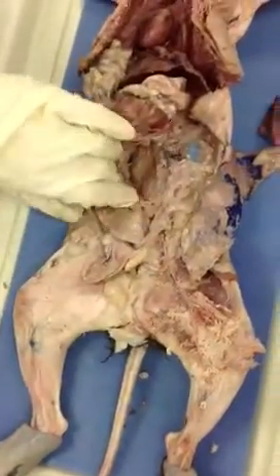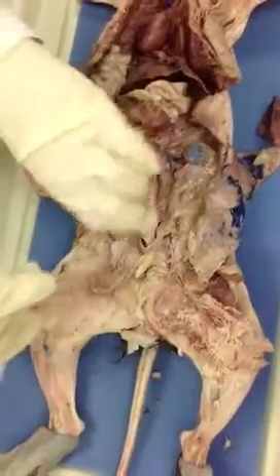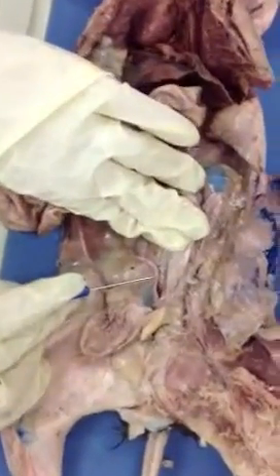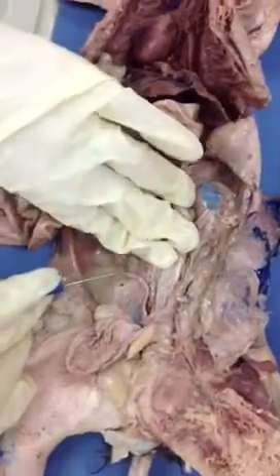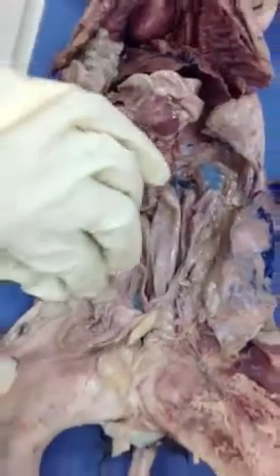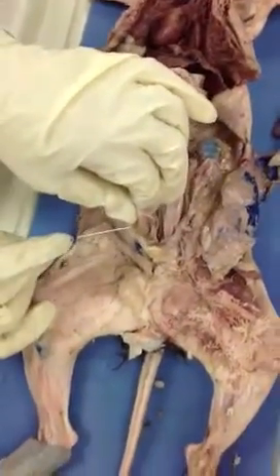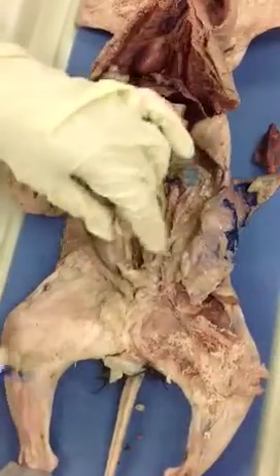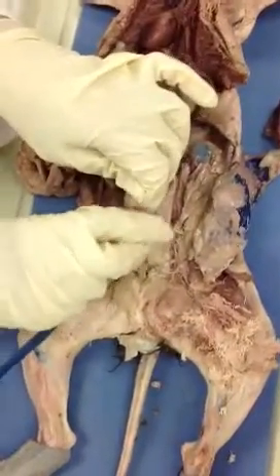Okay. There you go. So here we see the body of the uterus, right? And the left, it's the right uterine horn, right? And here we see the right ovary, right? Very good. Now, what is this structure that I have here in my hand? Bladder. Urinary bladder.